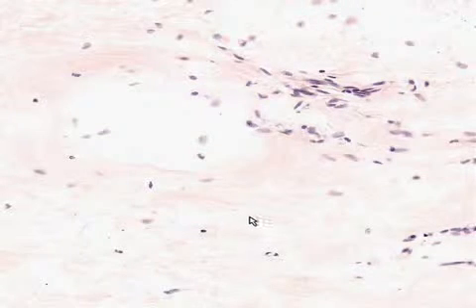When you see collagen fibers which seem to go every which way, that's what we call irregular connective tissue. Another thing we could say about connective tissue in general is that dense connective tissue is more likely to be regular or like tendinous, and loose connective tissue is more likely to be having fibers going every which way.